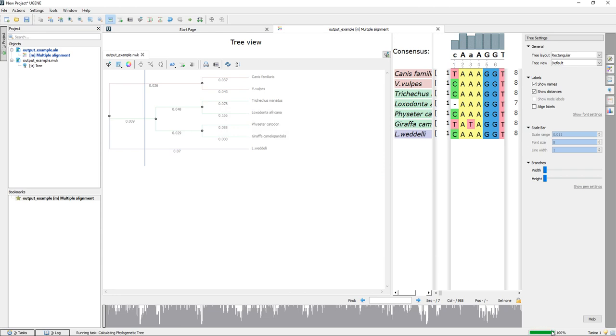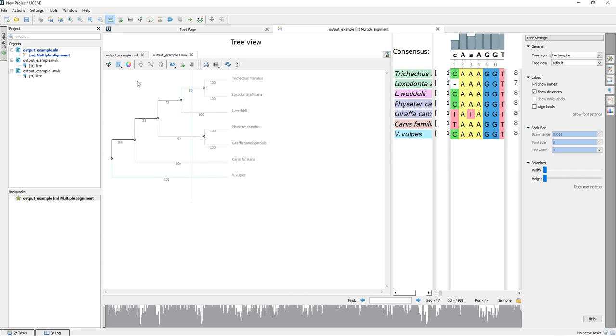There's our little loading bar. And once it builds, we have the same sort of tree, but now these numbers represent something different. Remember, we built this tree 100 times. So this branch, for example, we saw 100 times, like in every single tree that we built, whereas this branch here we only saw in 50. So generally numbers over 75 or so can be reliable.